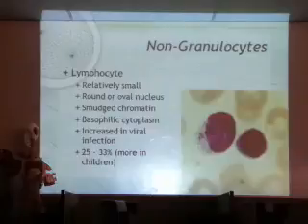Okay. Now we go to non-granulocytes, and there are only 2, lymphocytes or monocytes. And we'll start with the lymphocyte. Lymphocytes are relatively small, but they vary in size. Okay? Now remember, granulocytes, I told you, are about 15, 16 micron diameter.